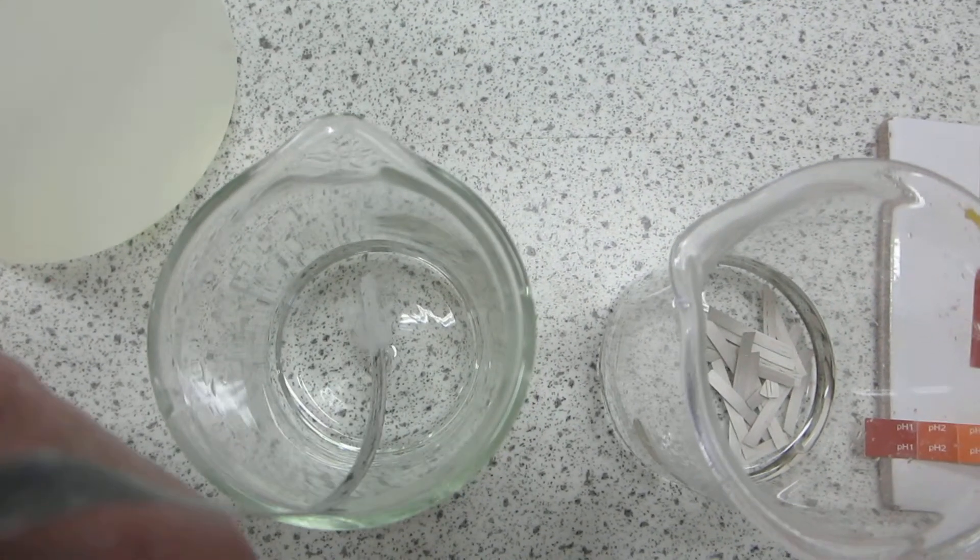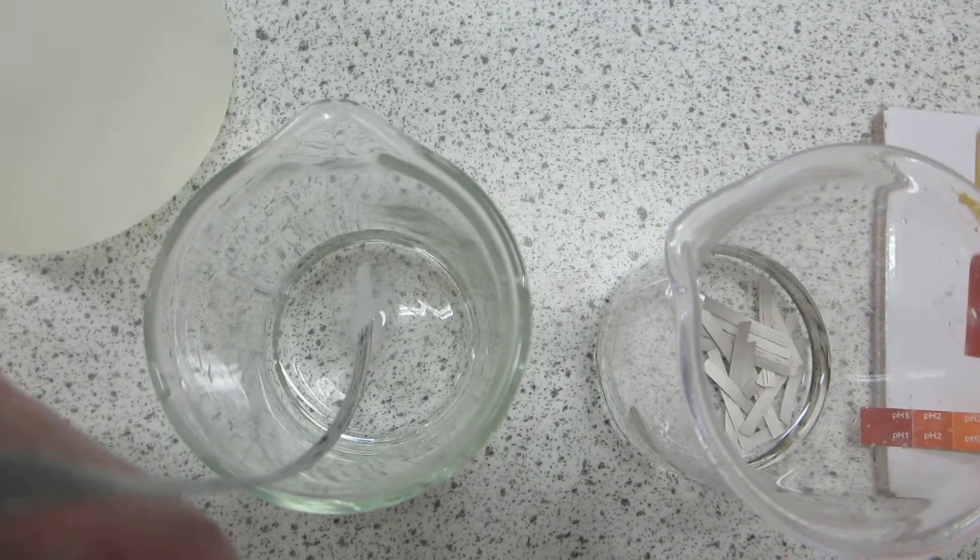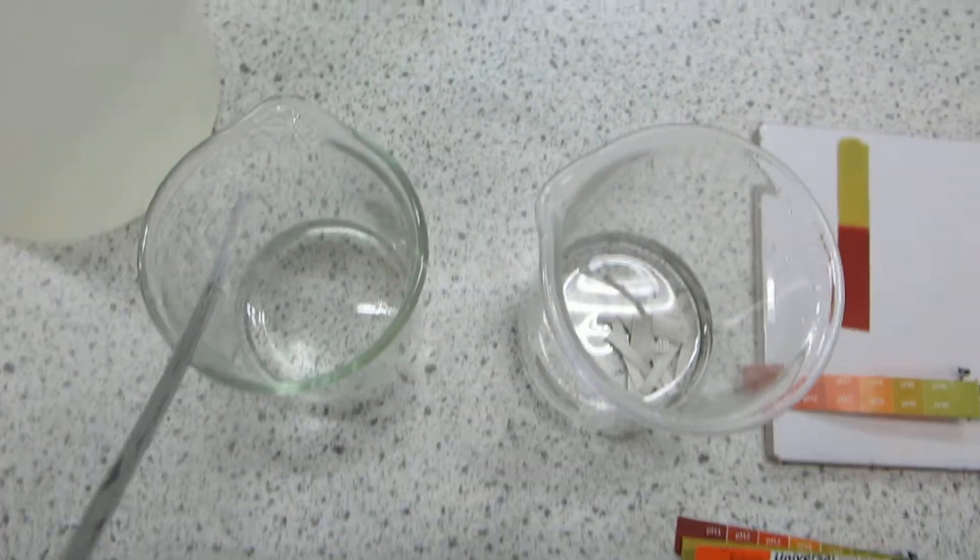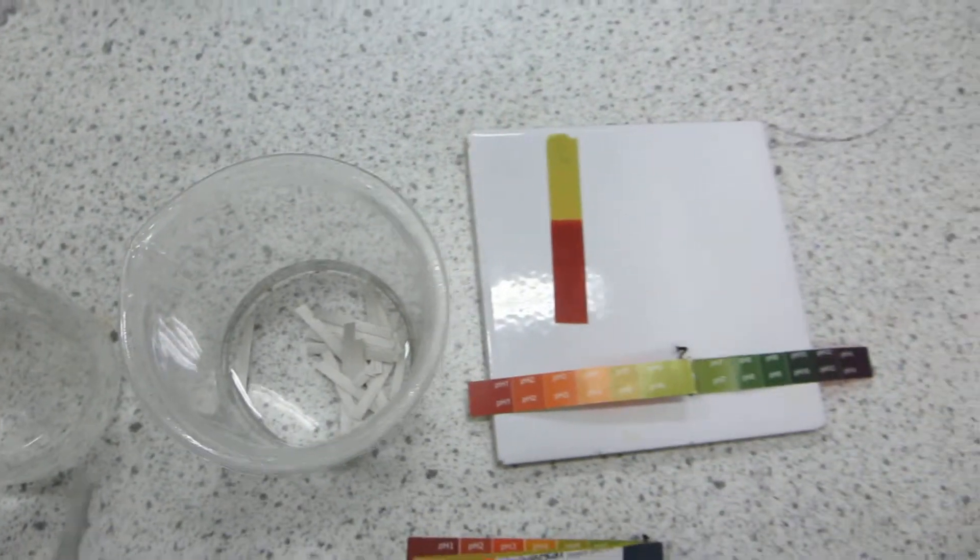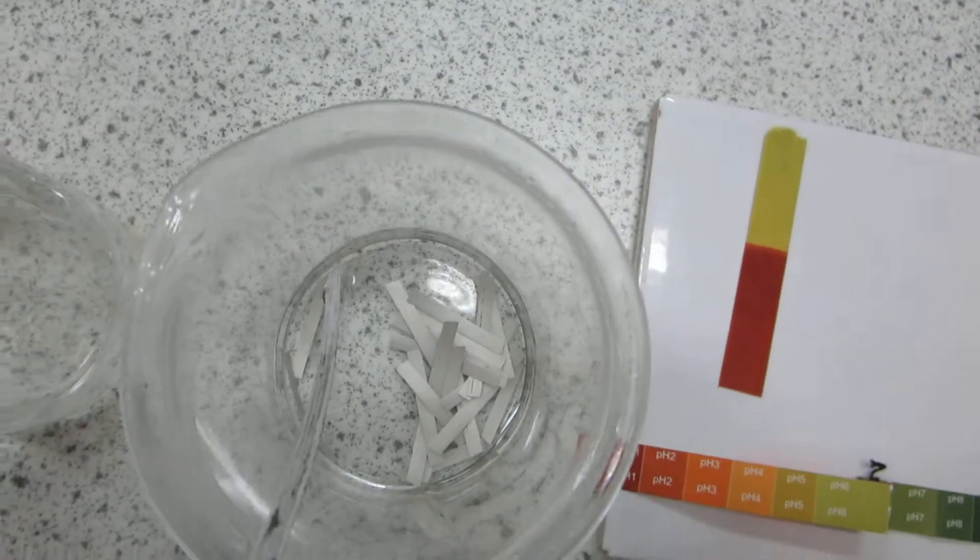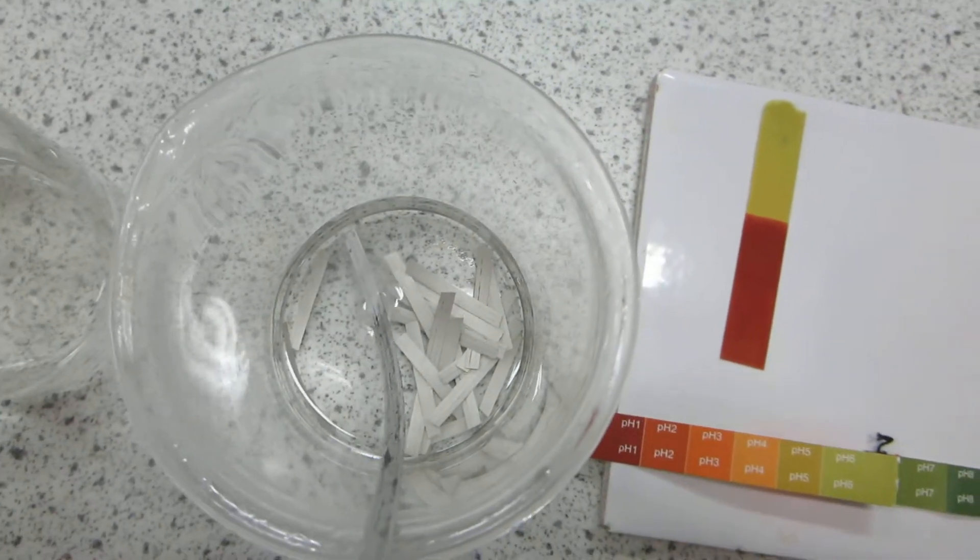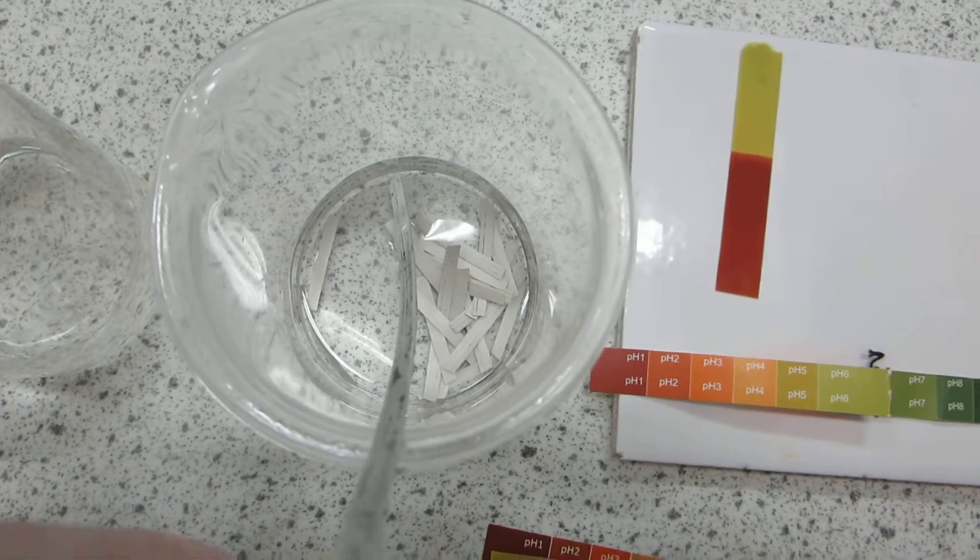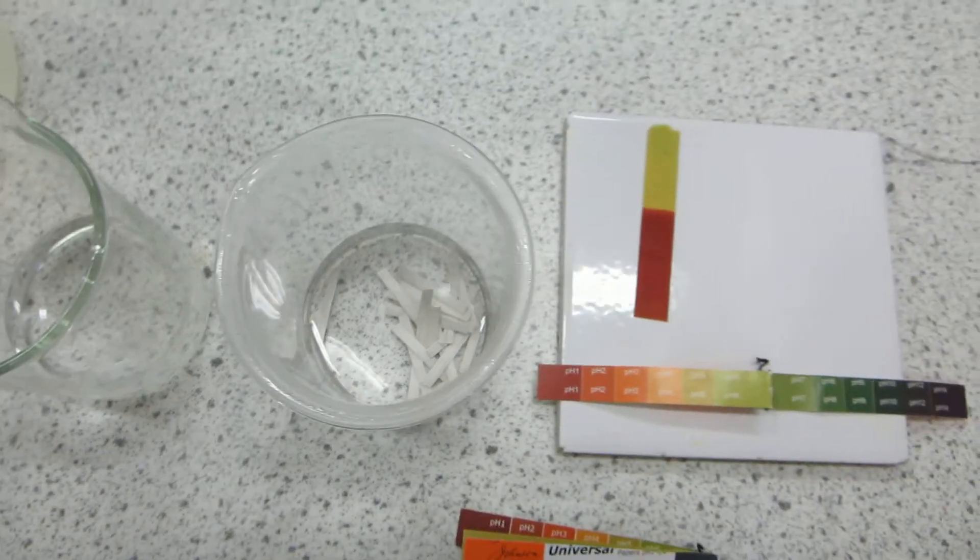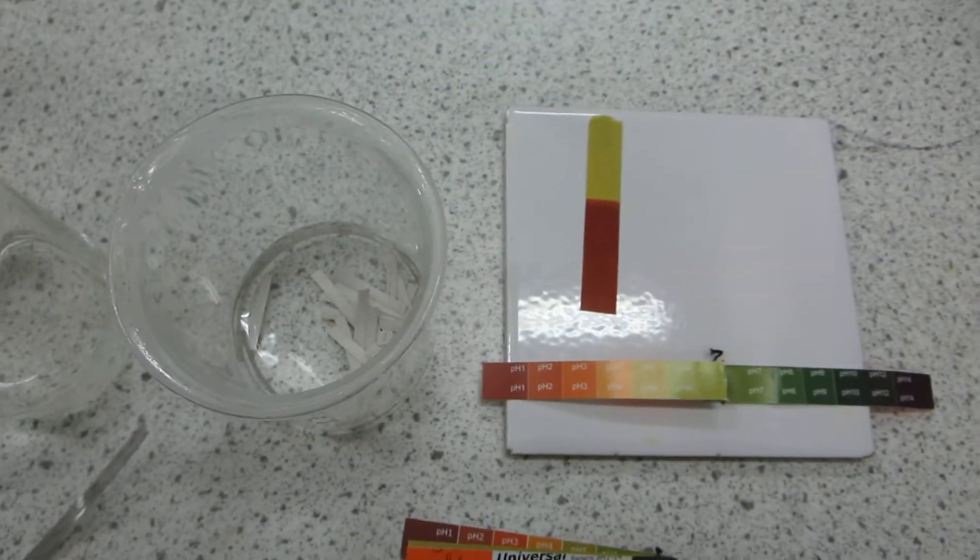The metal reacts with the acid there, and if you leave it overnight, the activity decreases until all the acid has reacted with the metal. So what's the pH after the metal has reacted with the acid?